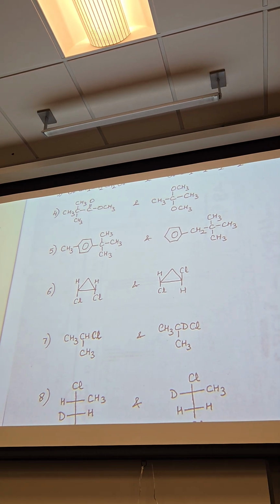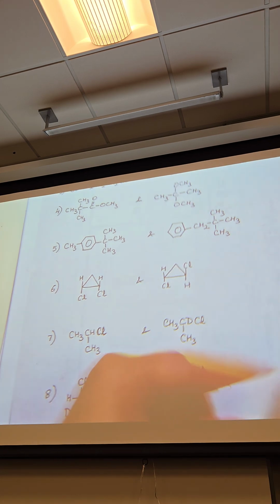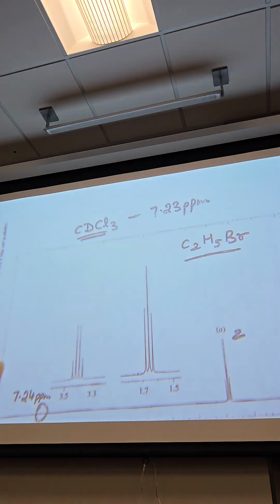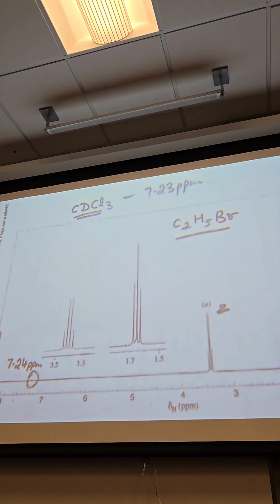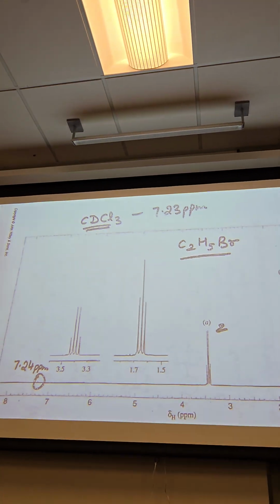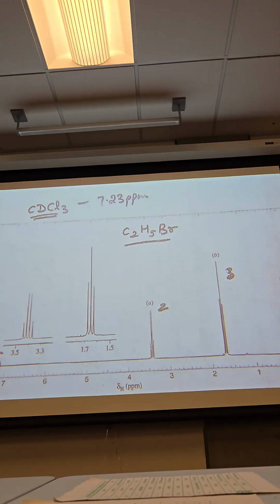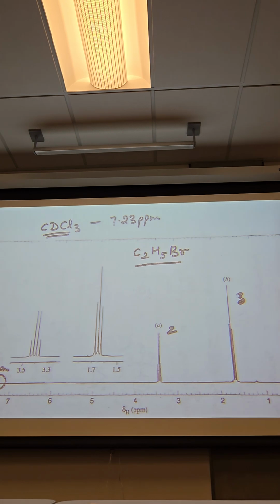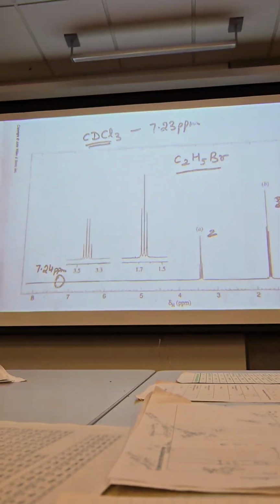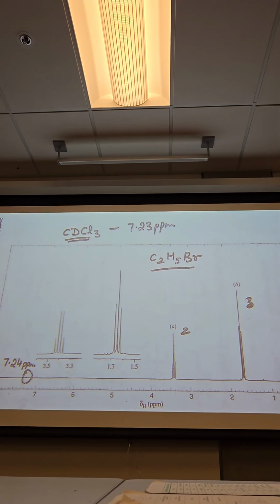Okay, so what I want to do starting today is at least spend time actually looking at specific proton NMR spectra and learn slowly, one at a time, to use those to figure out the structures of molecules. This is just a demo, more of an introduction to proton NMR spectra. So this is what proton NMR spectra look like.